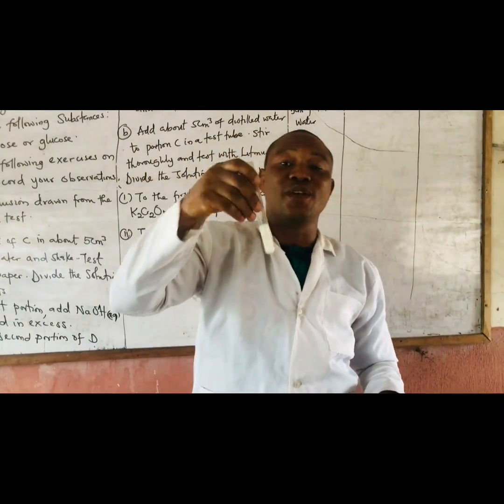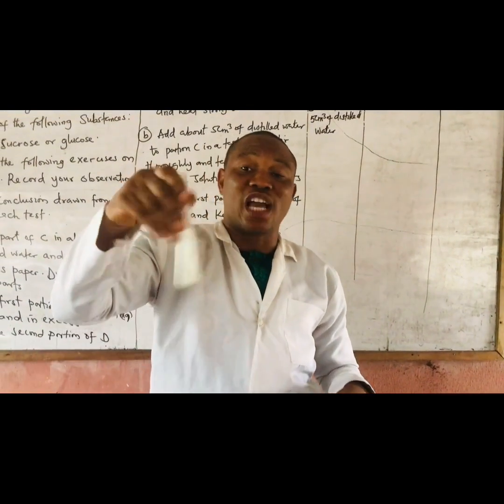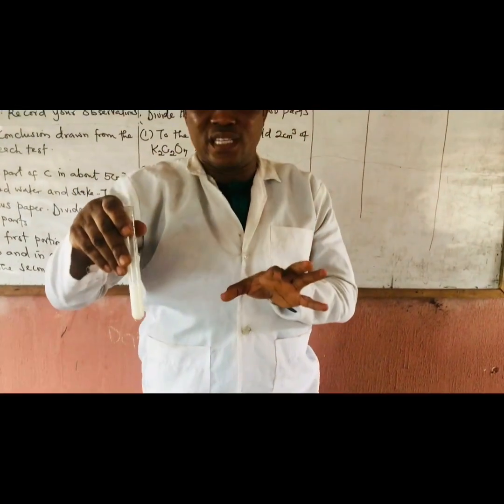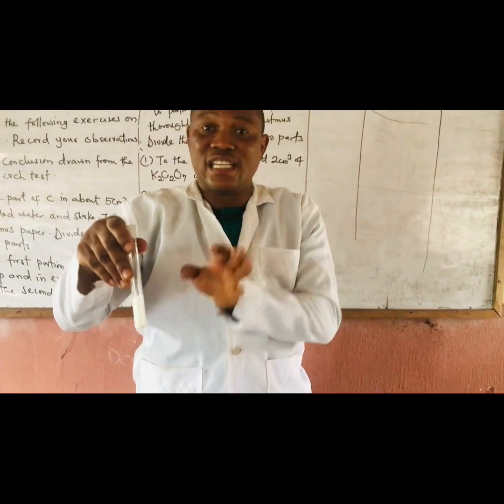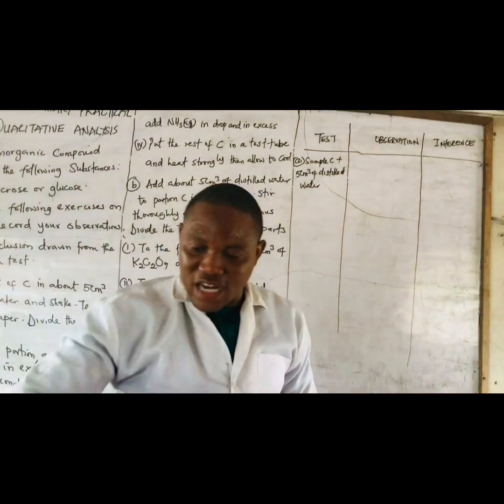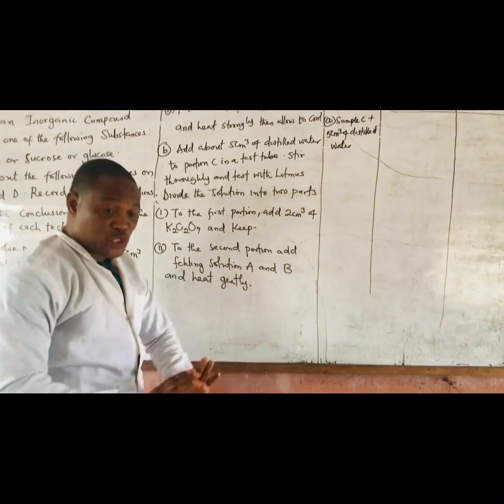And if you agree with me, when you shake it like this, that's the reason why when you are doing qualitative analysis, it will be as if everything has dissolved. But for you to be sure, you can just leave it to settle for a few minutes. If it has dissolved completely, then you will not be seeing any suspension or the salt looking like it is insoluble in water. So we can just leave it. But from indications, let's just leave this a bit so that we'll be sure. I want us to be sure of the solubility.